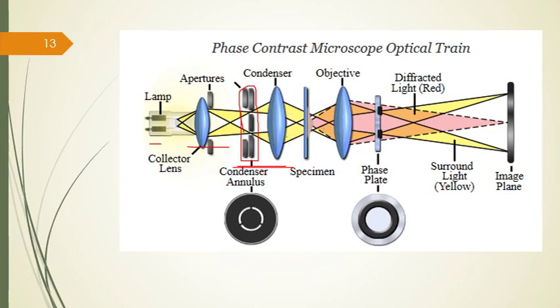After illuminating the specimen, the wavefront either passes directly, this is the way, undeviated, or is diffracted and retarded, as in this way. This is the diffracted or refracted light. The dotted lines indicate light diffracted or retarded in phase. By the structure and phase gradients present in the specimen, the diffraction or refraction depends upon the structure of the specimen through which diffraction occurs. The undeviated and diffracted light is collected by the objective.